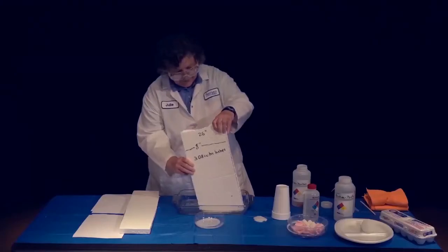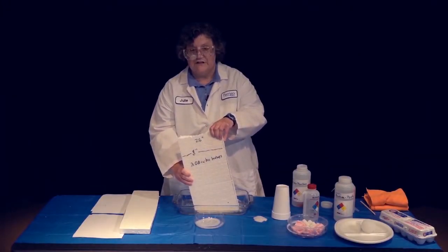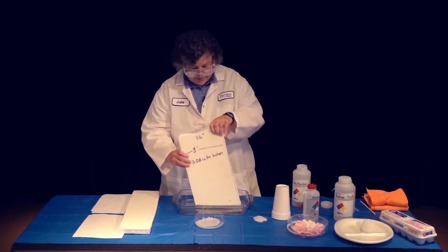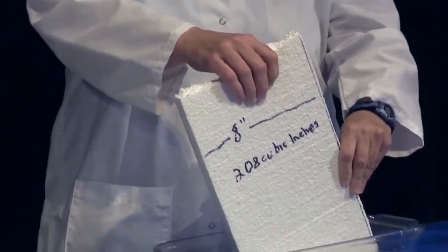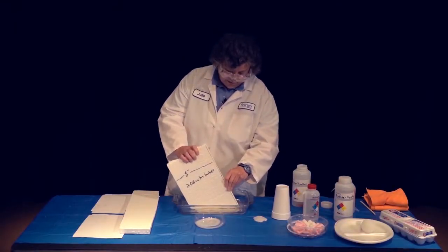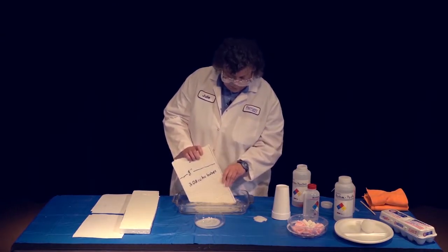So I was mentioning if you're going to do this at home, you need to think about safety. You want to have safety goggles on, protect your clothing, protect the surface that you're working with, because acetone dissolves all sorts of things. It dissolves lots of plastics. And that makes disposing the used acetone difficult. You have to think about how you're going to dispose of the acetone when you're working at home.